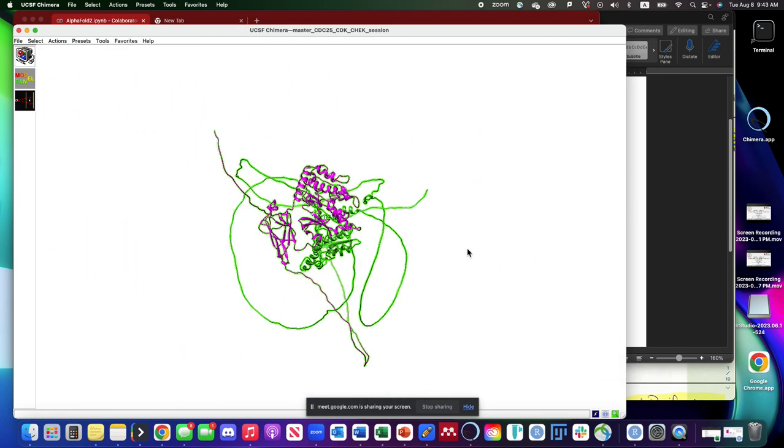Basically, if you don't have a mouse, I have no idea how to do all that. I open Chimera on my laptop without a mouse, and somehow I always figure out how to maneuver it around, but I don't know the commands off the top of my head.